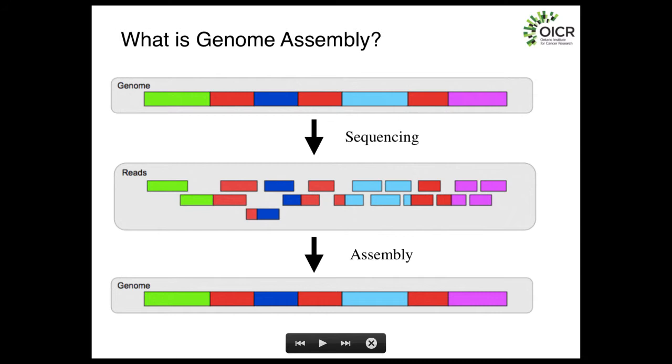Now, in this cartoon that I've drawn for genome assembly, we've segmented the genome into portions that are unique and portions that are repetitive. The repetitive portions are shown in these red bars here, where each is present in three different copies. Now, these are going to be the real challenge of assembling the genome. When we have one of these repeats that's longer than the length of our reads, like if you have a repeat that's 1,000 bases and you have 100 base per Illumina read, we can't actually figure out the order of what these pieces go in because the read doesn't cross the repeat boundary into this unique sequence. So that's why we're going to want to focus on trying to assemble either the unique regions, if you have short reads, or getting longer reads such that you can span the different copies of the repetitive regions.